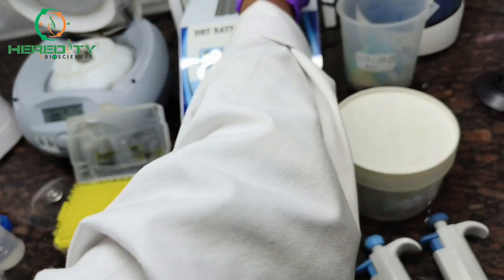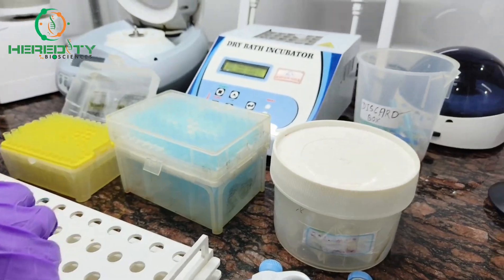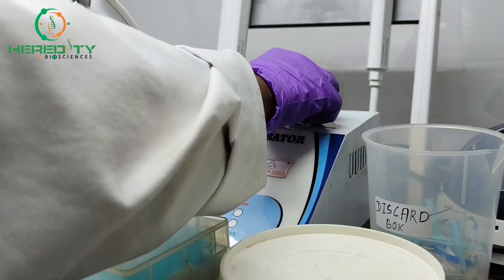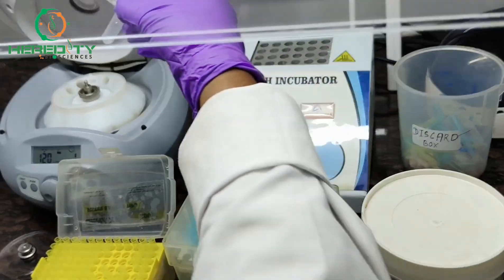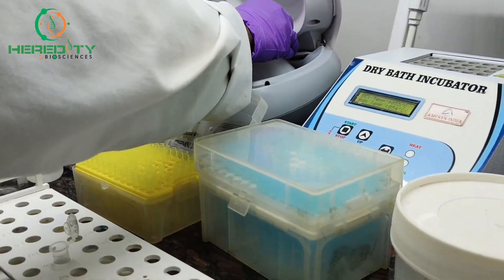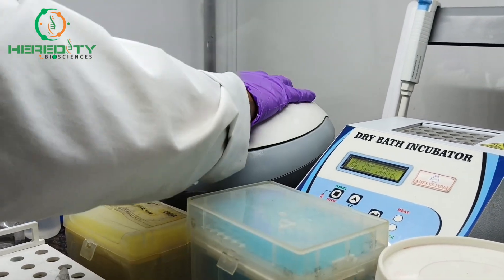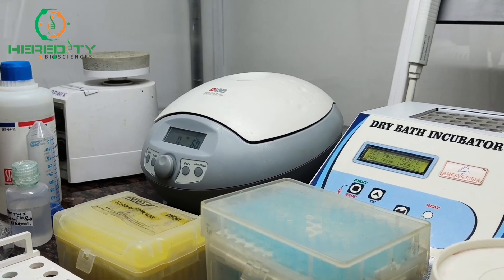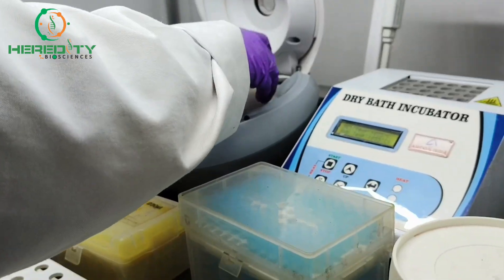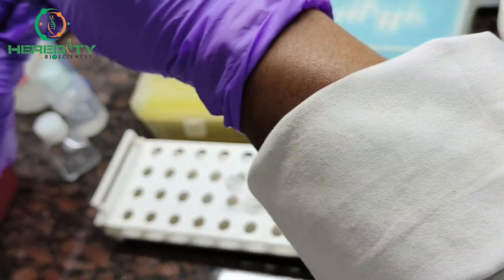Incubate it at 55 degrees Celsius for 5 minutes. After 5 minutes of incubation, we will centrifuge it at 10,000 rpm for 1 minute. After centrifuge, we will collect the supernatant. Here is our DNA.